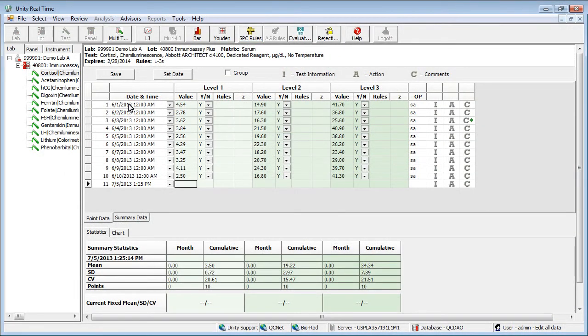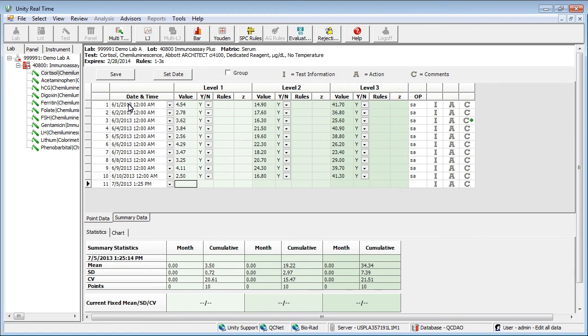If you've already submitted data, please contact Biorad after you've made an edit. If you've not submitted your data, click the field you want to edit. Change the value, then click Save.